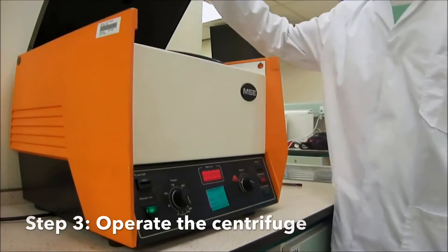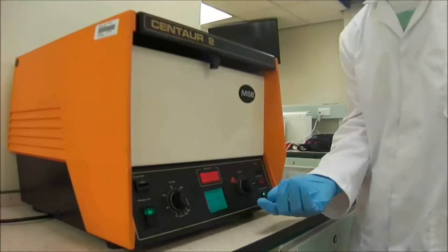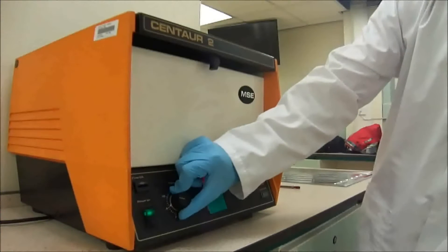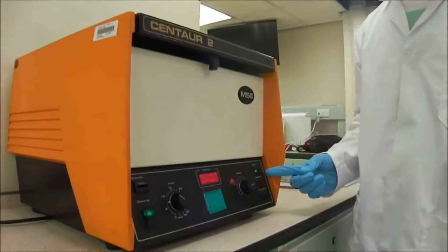To begin centrifuging, close the lid and turn this knob to set the rotation speed to maximum. Next, set the timer to 10 minutes. At this point, the machine will start rotating as indicated by the green light here.